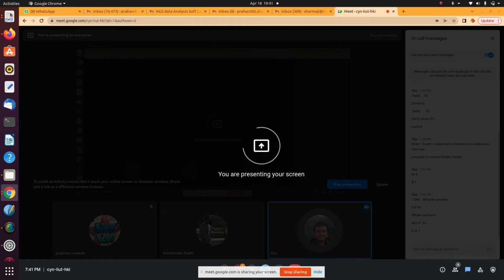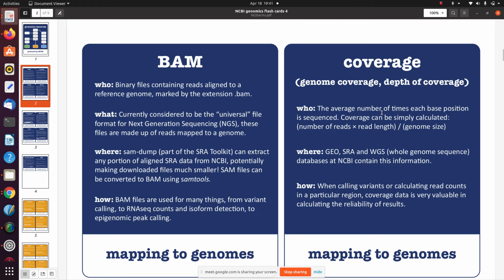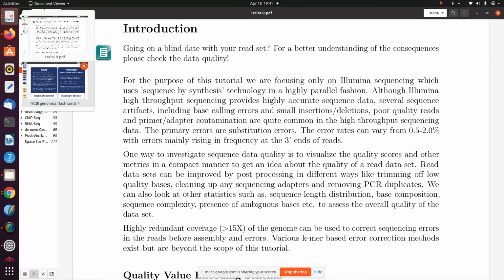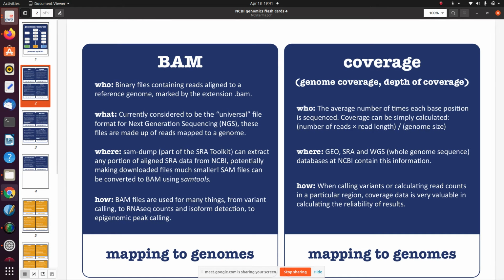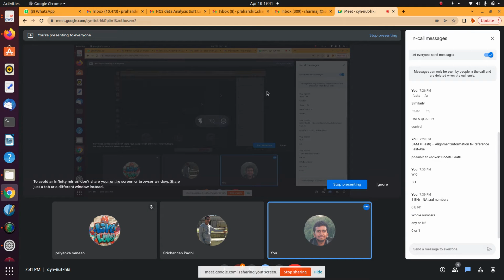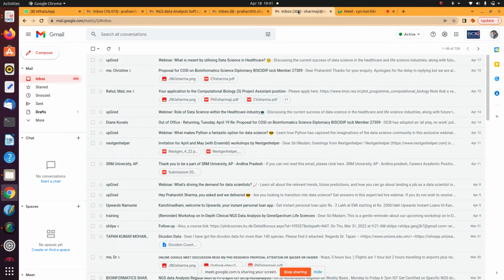Okay, so coming back to coverage, why did we share this work? So fundamentally, here I am saying I'm randomizing 8 strings in binary, and where is that PDF? So I downloaded it here.